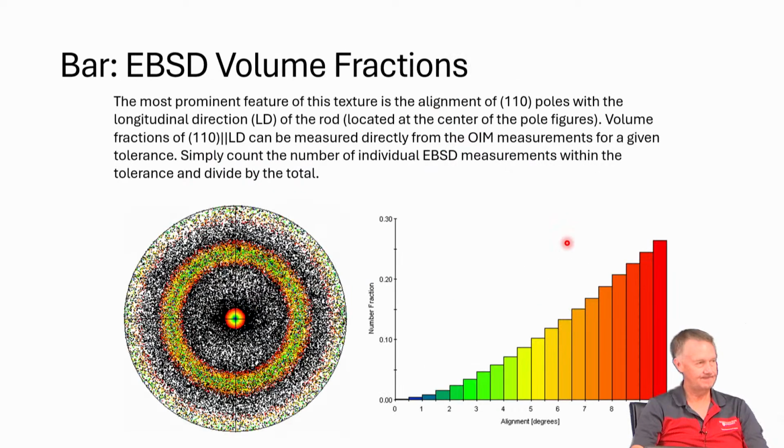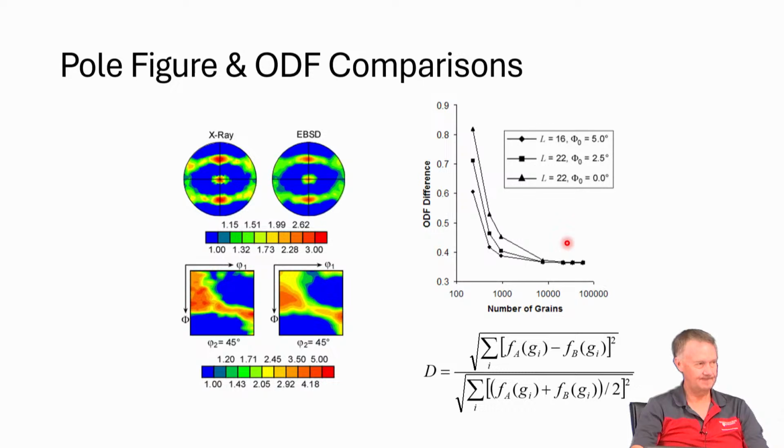So if we have a large number of data points, meaning grains, different grains, then we can reduce the fragmentation. We can make a very small Gaussian half-width. Right, we don't really need it then.